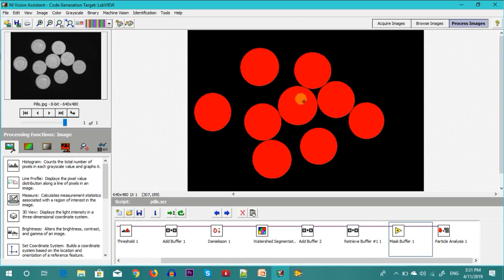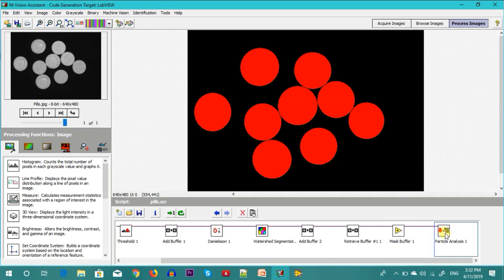If you look at your computer screen you will find the particles have been separated. After separation you can go for particle analysis. Comparing cell analysis and pill analysis, the idea is the same — in the cell culture case we segmented the foreground using separate objects, and in the pill case we segmented the background using watershed. These two approaches can be used interchangeably for either application.